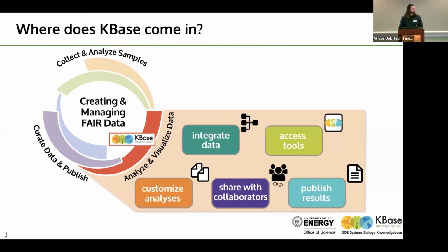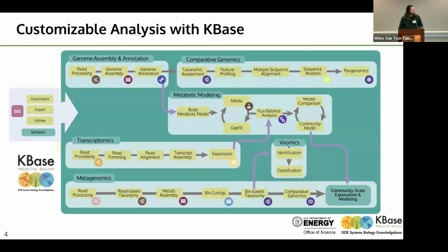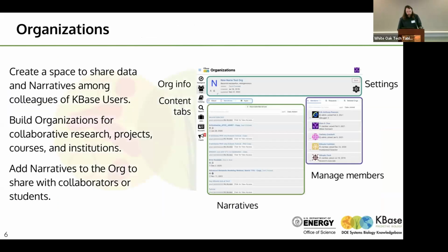But you can also share your work in your publications for the larger community to have access to as well. So this just kind of demonstrates that after assembly and annotation, there's quite a few further analysis that you can do on the system using all of our apps and tools.